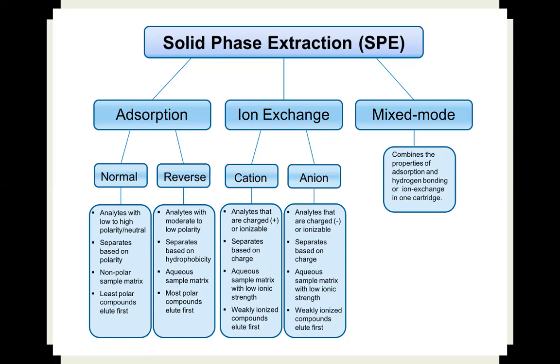So we have to know the characteristic of the adsorbent that you have, and then the types of analytes that are of your interest, whether you have moderate to low polarity or low to high polarity. Okay. And what types of sample? For normal, you have non-polar sample matrix. For reverse, you have aqueous sample matrix.